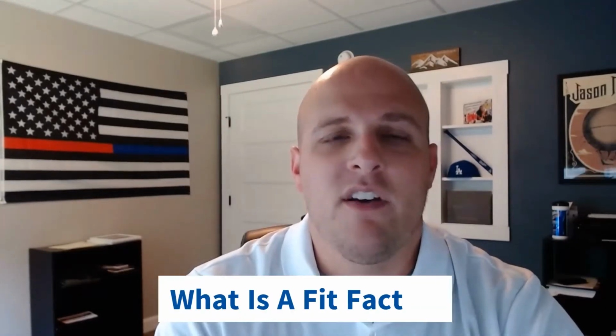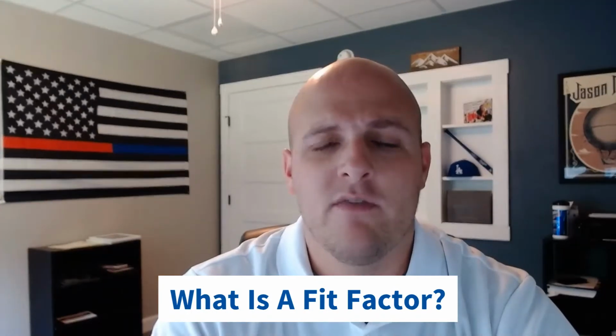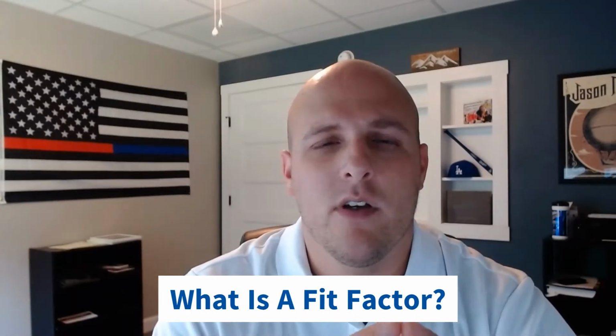So we just mentioned a fit factor. What is a fit factor? A fit factor is a result from your fit test that compares the concentration of a substance in the outside air versus the concentration of that substance inside your respirator. So it's going to compare outside the mask versus inside the respirator, making sure that the fit factor is at the acceptable limit and you have the least amount of leakage possible.